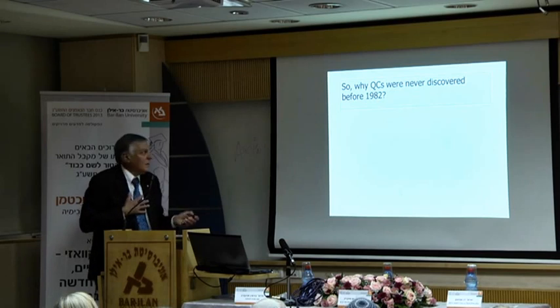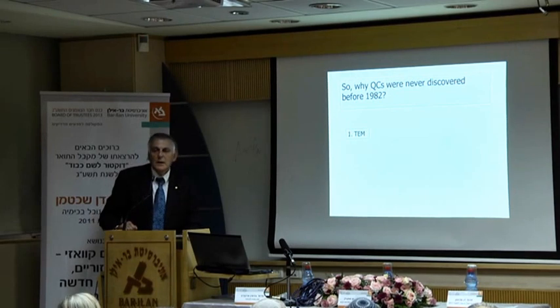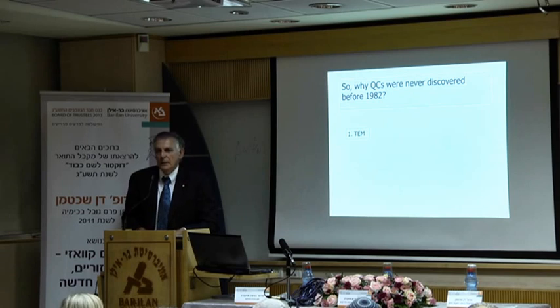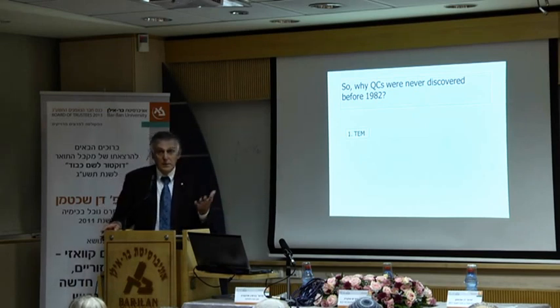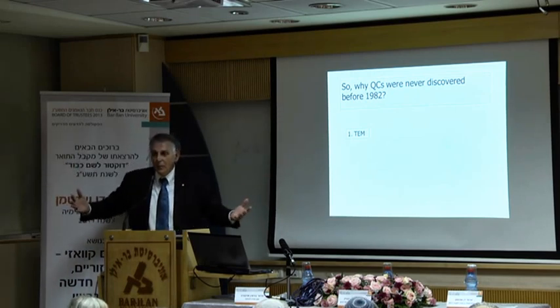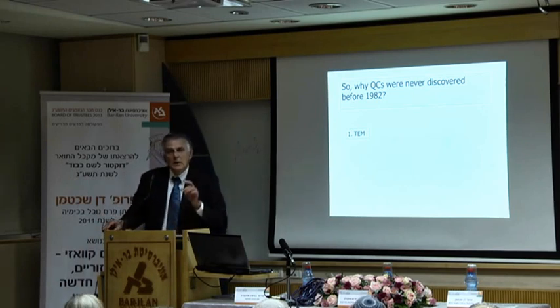My answer is, number one, TEM, transmission electron microscope. Quasi-periodic materials could not have been discovered by any other method but transmission electron microscopy because they were very small. X-ray could not discover them. So, okay, you can say, well, hundreds of thousands of students around the world over the years used electron microscopy, why you? Well, let me tell you something that you may not know.